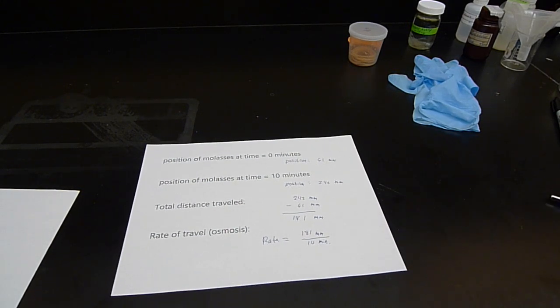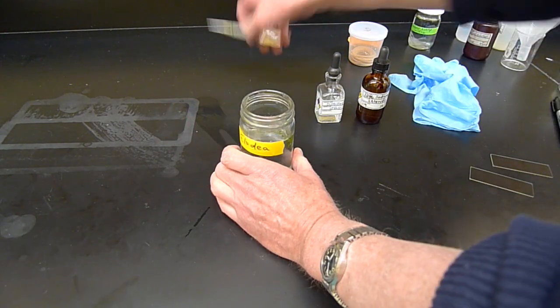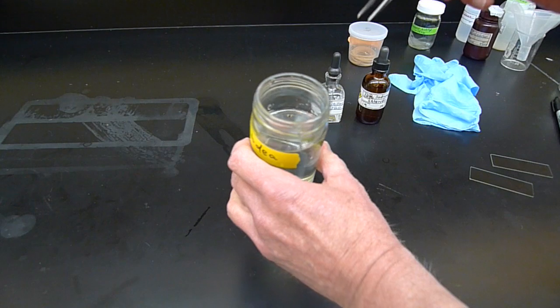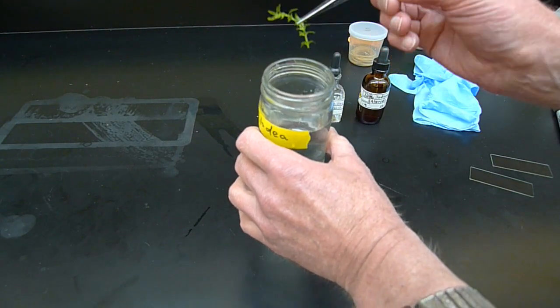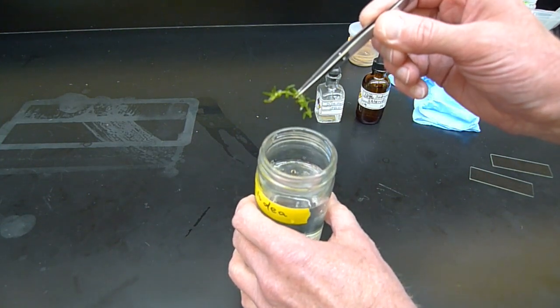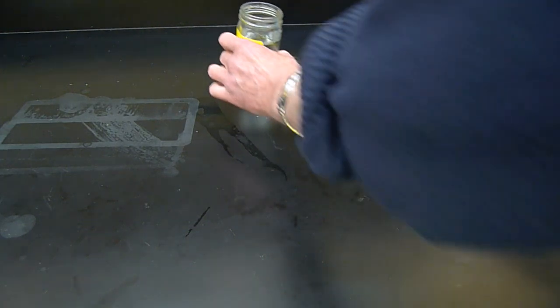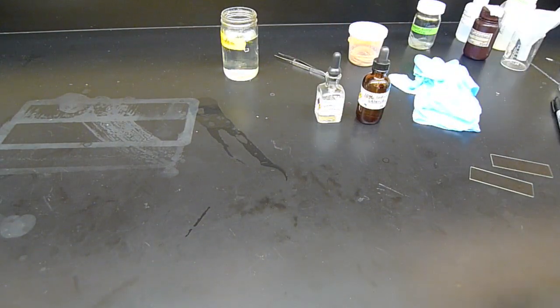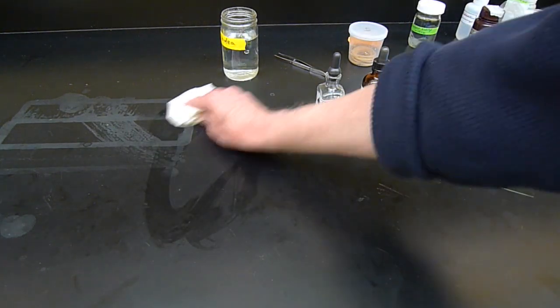Next up is one more osmosis experiment using elodea leaves, an aquatic plant. So for our last exercise in osmosis, this is another version of osmosis. We're going to use the aquatic plant we have in the lab here called elodea. There's a little bit of sprig of elodea here. I'm going to rip off some leaves here and put them in different solutions. So I'm going to put it in distilled water. I'm going to put it in some sodium chloride solution. And you can see what happens to the cells when they're in that environment.